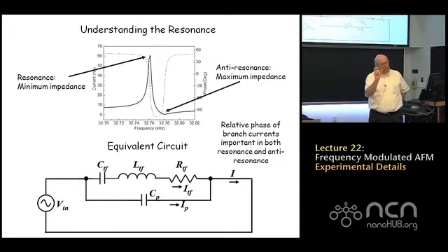It's not governed by the physics that was described for the resonance of a silicon cantilever, right? The shape of the resonance of a silicon cantilever is governed by the way that silicon cantilever is excited. There are 2 modes of excitation.